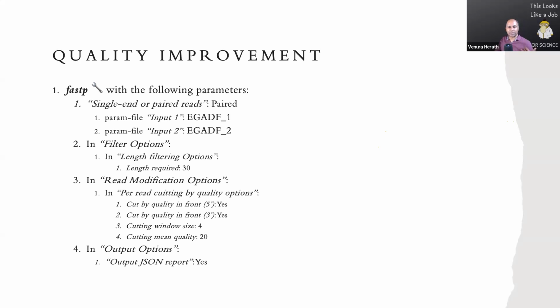Okay, so there's a big help manual if you're interested. Every tool you load has, at the bottom, right after the email notification, an area with the quick help and also the link to the major tool. So you can go to the tool site and see what these parameters are and how we can play around. Each heading is already described in the user manual.